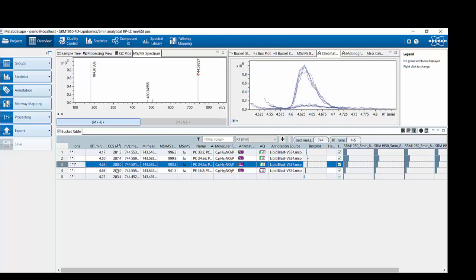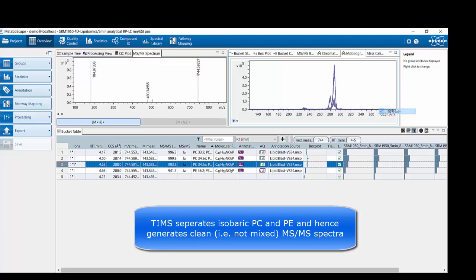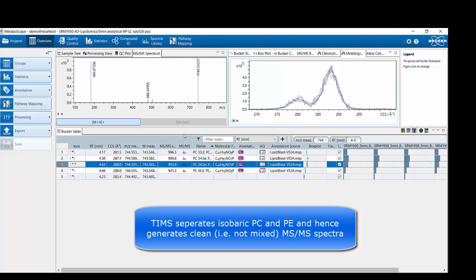We can also see different CCS values. Looking at the mobilogram for the PC, two ions were extracted. Focusing on the M+H only and zooming in, we can see why we get clean MS-MS spectra. On the LC domain we could not separate these isobars, but on the trapped ion mobility separation domain we could separate the precursors based on their mobility.